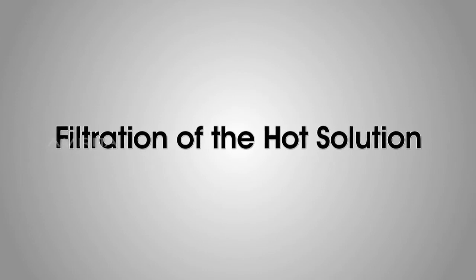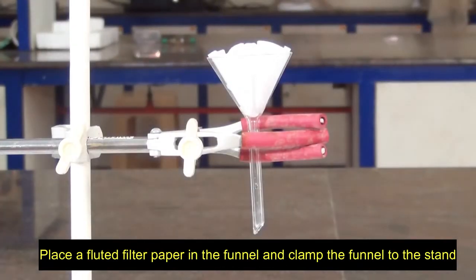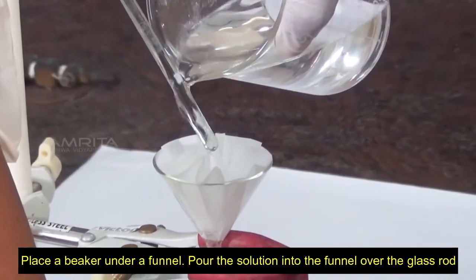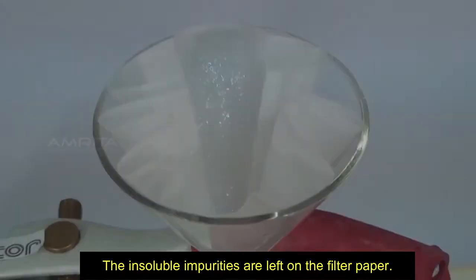Filtration of the hot solution. Place a fluted filter paper in the funnel and clamp the funnel to the stand. Place a beaker under the funnel. Pour the solution into the funnel over the glass rod and collect the filtrate in the beaker. The insoluble impurities are left on the filter paper.